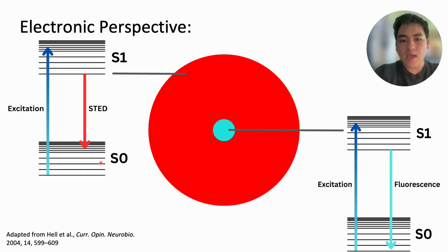Right, correct? And so if we take a look at the middle unimpacted beam, we can see that this natural fluorescence occurs and is a result of just letting it happen naturally. You're not putting any impetus in this. All you're doing is allowing the fluorophores to glow and then release their electrons naturally.